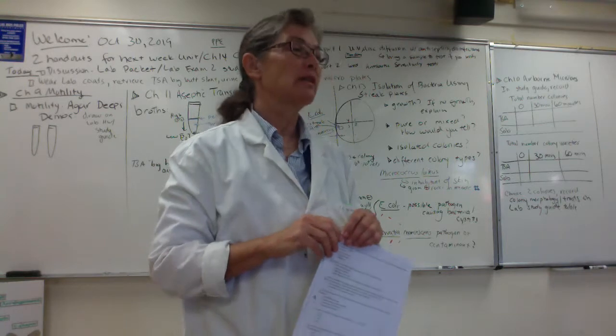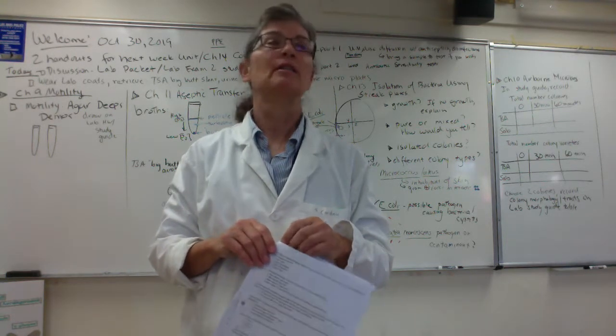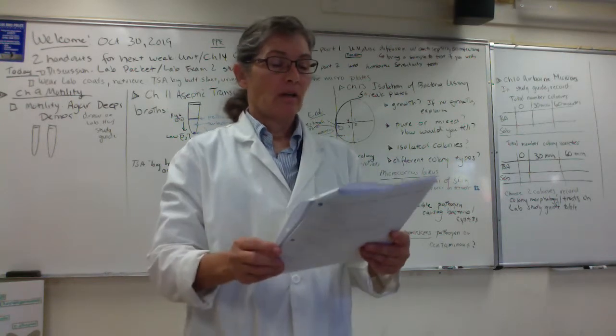Yeah, to do our metabolic test to identify them. And what else? If it's a pathogen, antibiotic sensitivity testing. And again, you guys, we're going to do antibiotic sensitivity testing next week. Good. All right. Okay, you guys.